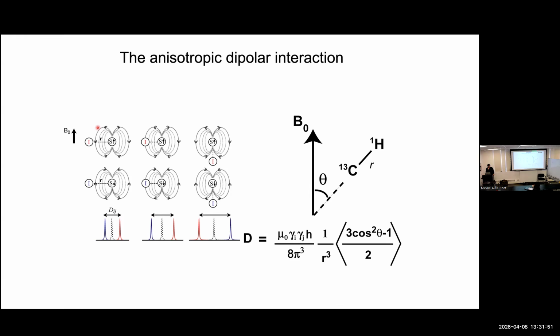What could you apply to a molecule? You have a molecule, it's got properties, it's in the test tube, it's in solution, you want to partially align it. And for those of you in my lab, you think about ideas other than the answer. Are you saying spin alignment? Great question. Can I cheat the spin alignment?